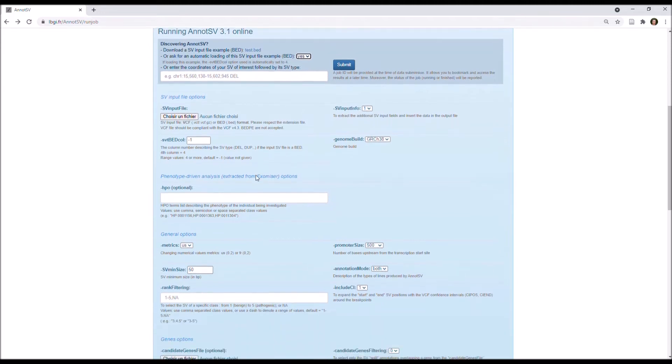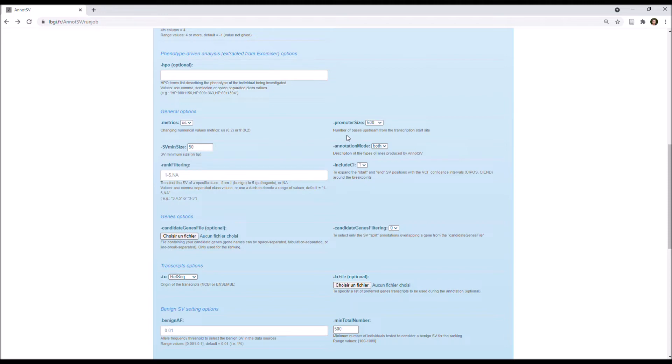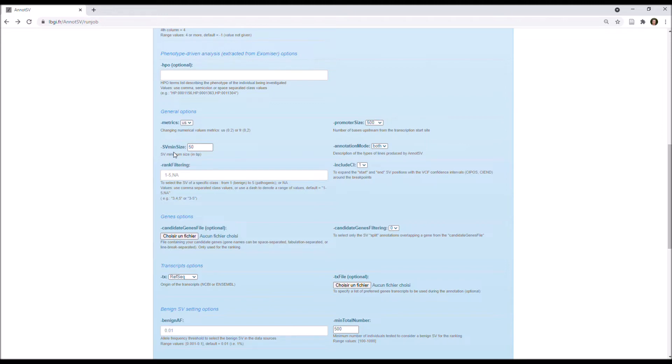The matrix option permits the numerical values to be changed by using a comma instead of a point, and the promoter size option defines the number of bases upstream from the transcription start site. You can also change the SV minimum size here, and it's good to know that AnnotSV doesn't analyze smaller variants, depending on this threshold.